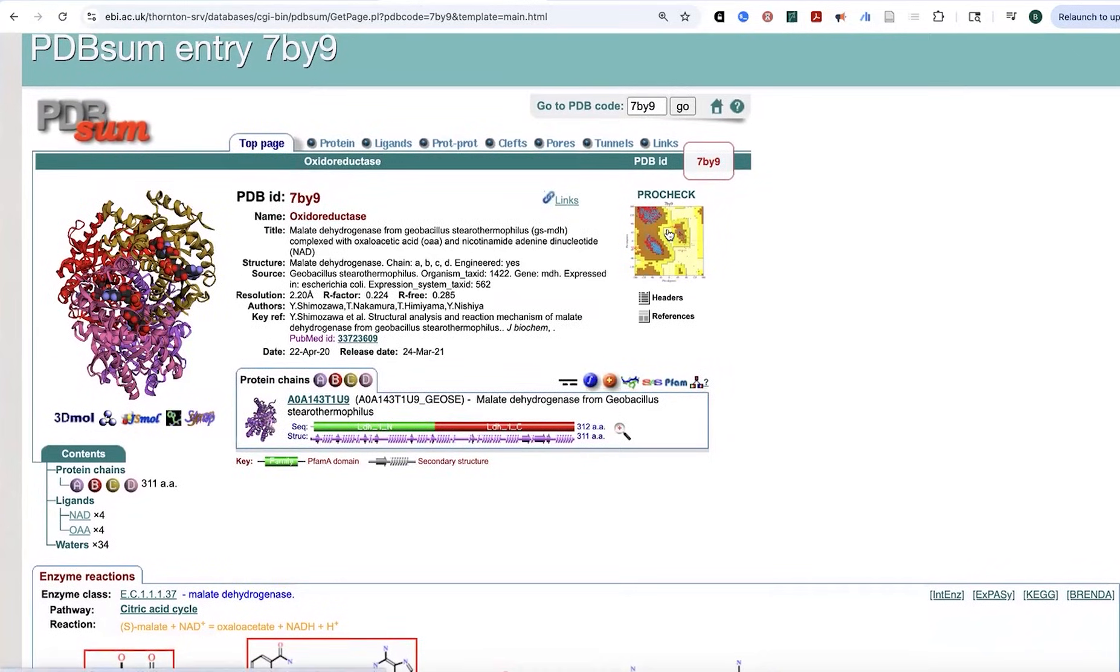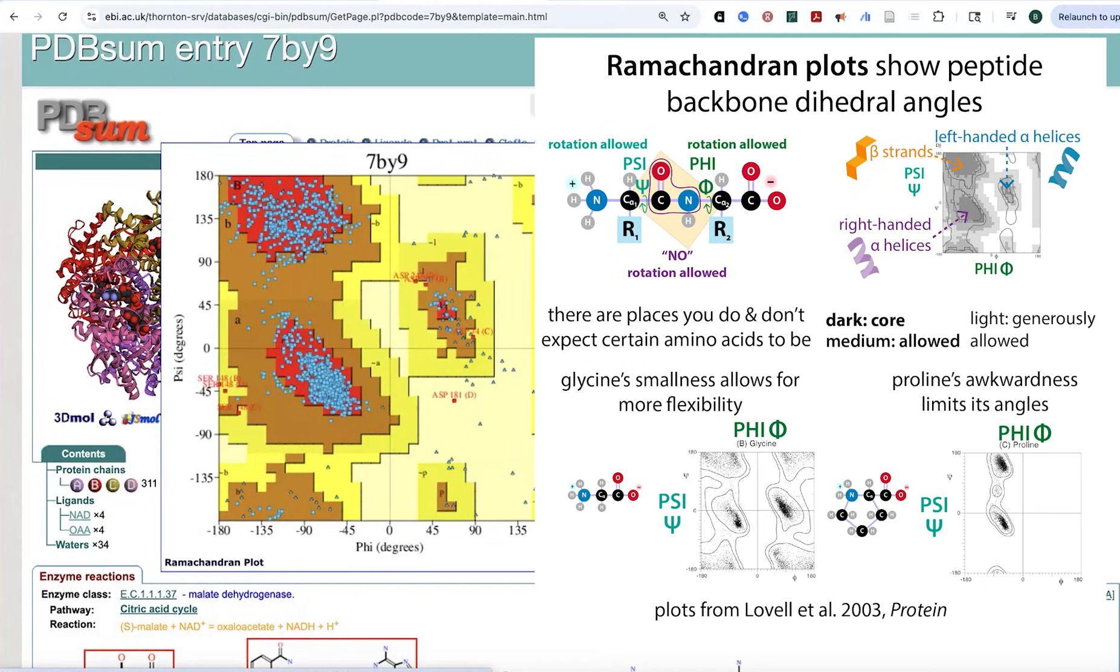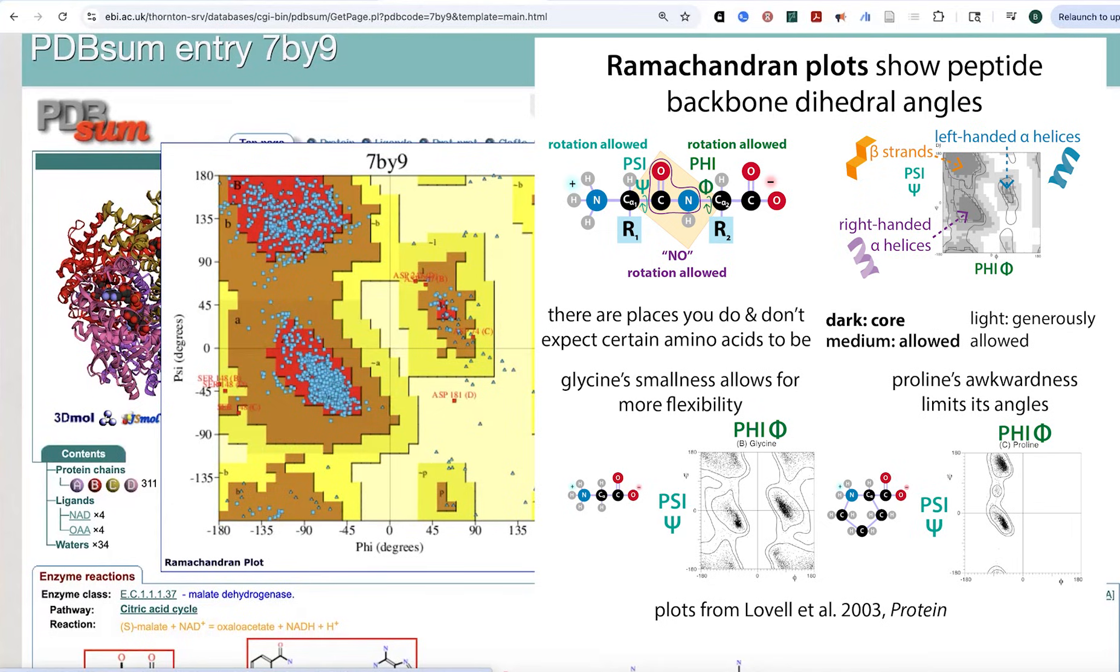We have four instances each of NAD and oxaloacetate, and there are 34 waters that have been modeled. Speaking of modeling, you can go and you can look and see a Ramachandran plot showing you the backbone angles that are in that protein structure file. And so this is going to show you kind of whether the angles are what you would expect for a protein.